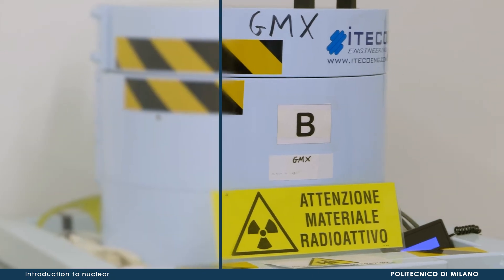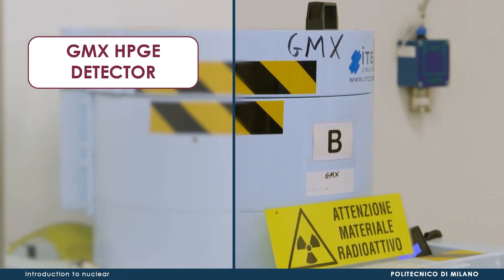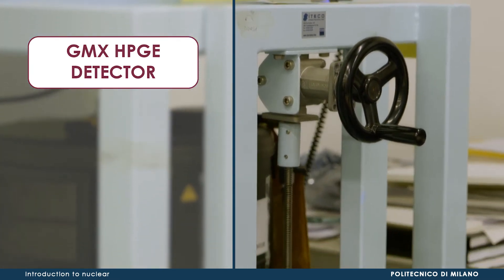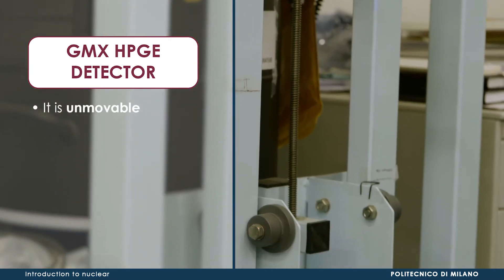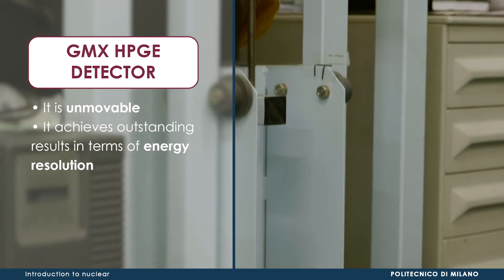The second device is a GMX hyperpure germanium detector. Its crystal is kept at cryogenic temperatures thanks to liquid nitrogen. In contrast to the previous detector, it is unmovable, but achieves outstanding results in terms of energy resolution.